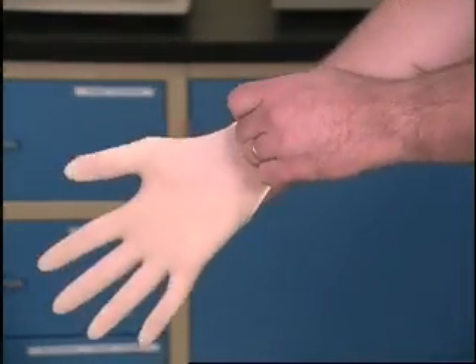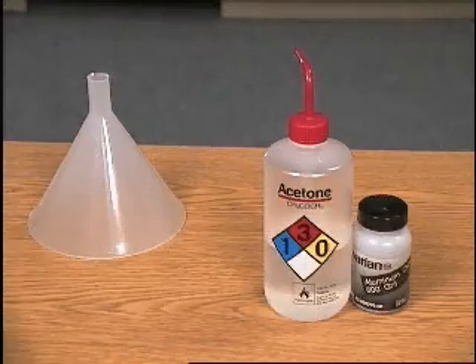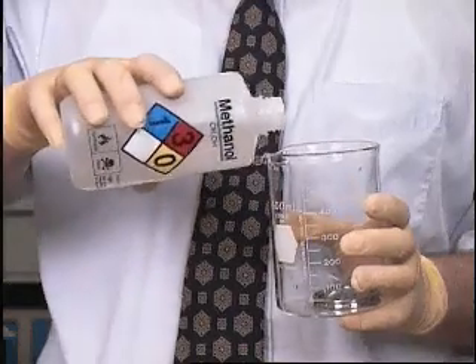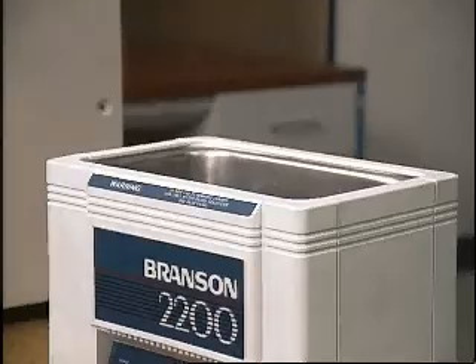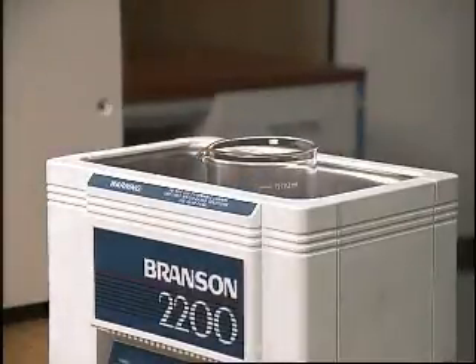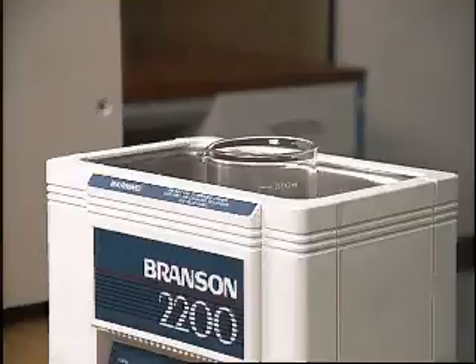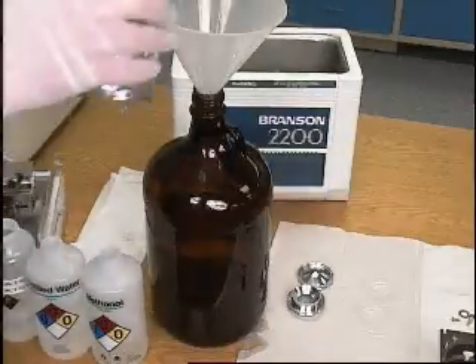Be sure to wear gloves when handling hazardous chemicals. Place the parts one at a time into a beaker and add fresh methanol. Subject the beaker and its contents to ultrasound for about one minute. Repeat the process for each electrode. Properly dispose of all liquid wastes.